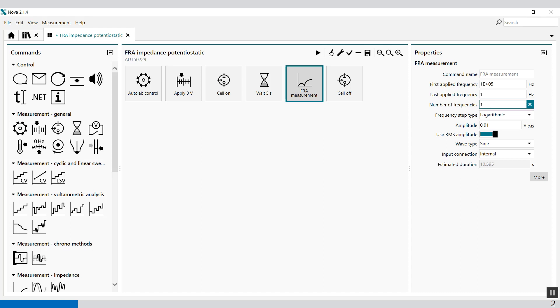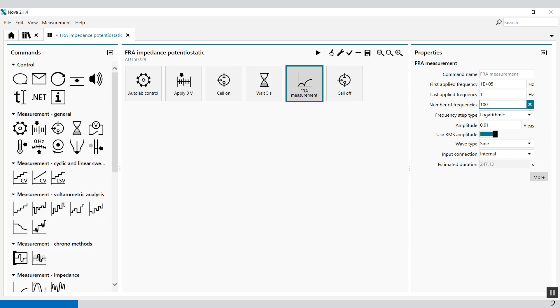The amount also gives you an estimate of the duration. If you select 100 frequencies between those two with a logarithmic distribution, it will take 247 seconds. But if you only take 10 frequencies in between, it will only take 25 seconds. So it depends on how you define the distribution of the frequencies.